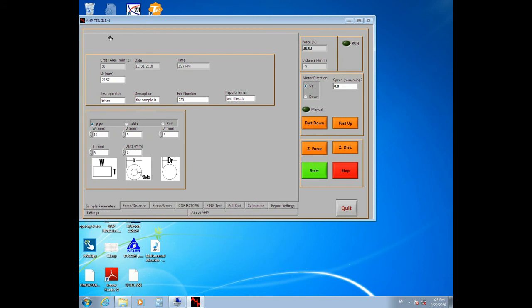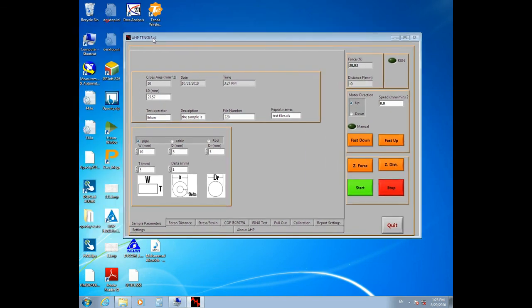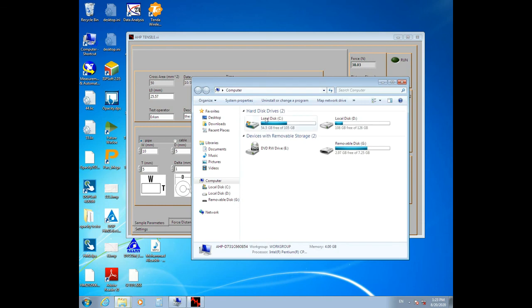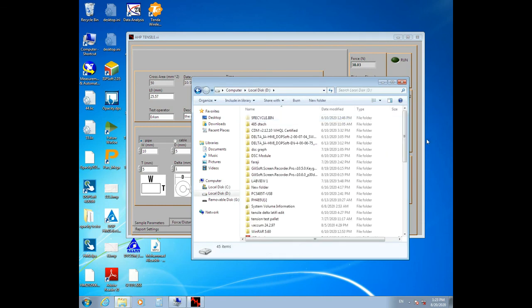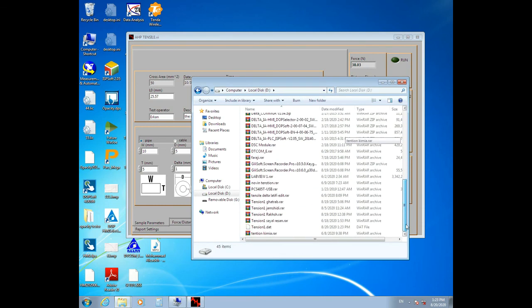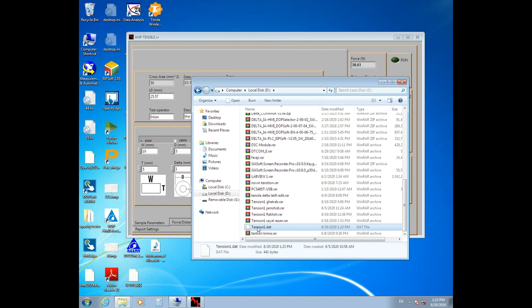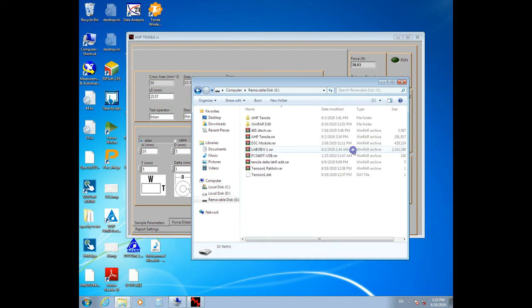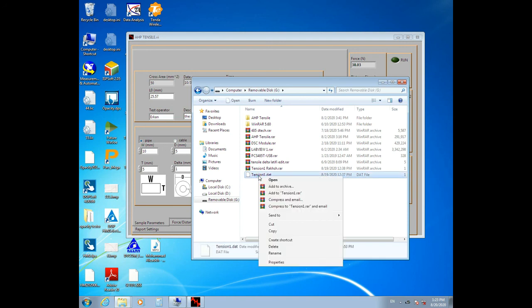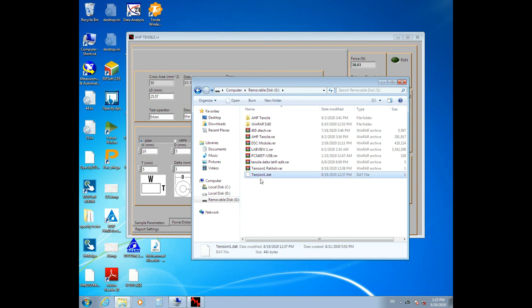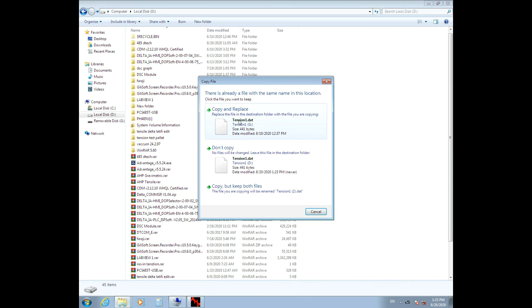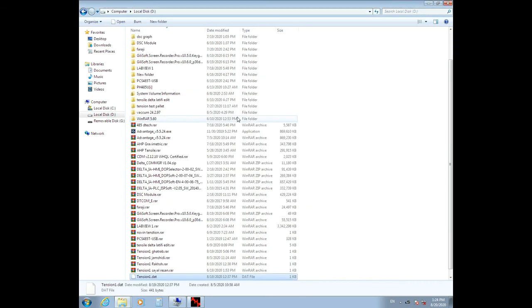After that, a file named Tensile1.dat has been created on your Drive D. Go to your USB flash and copy the Tensile1 file. Go back to Drive D, paste it here, and click copy and replace. This file contains calibration values of your machine that provides data for your software.